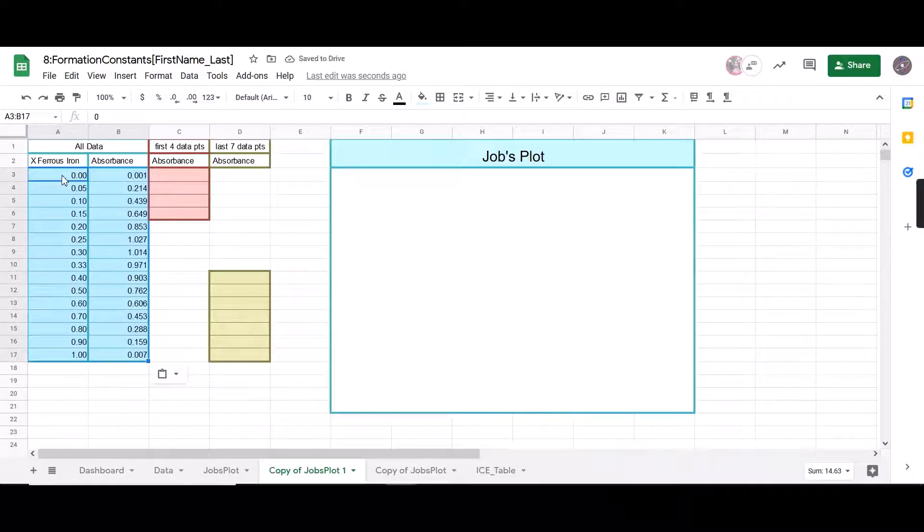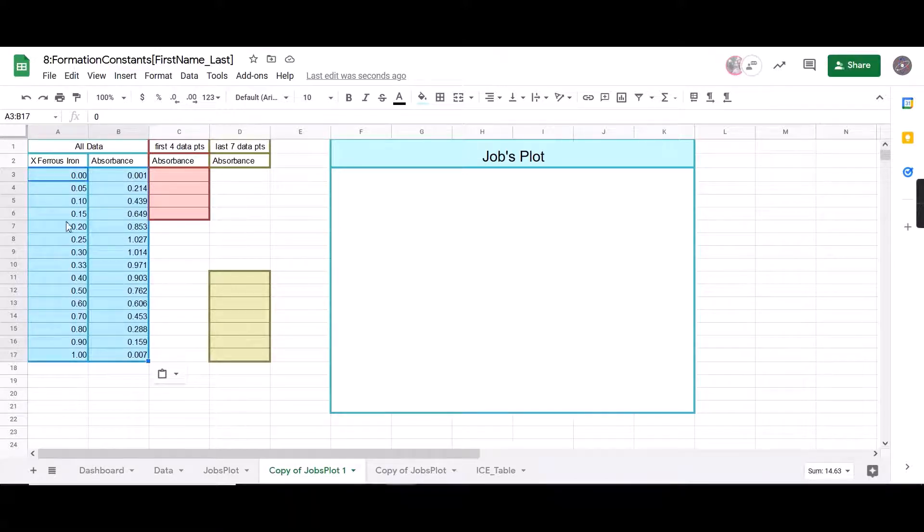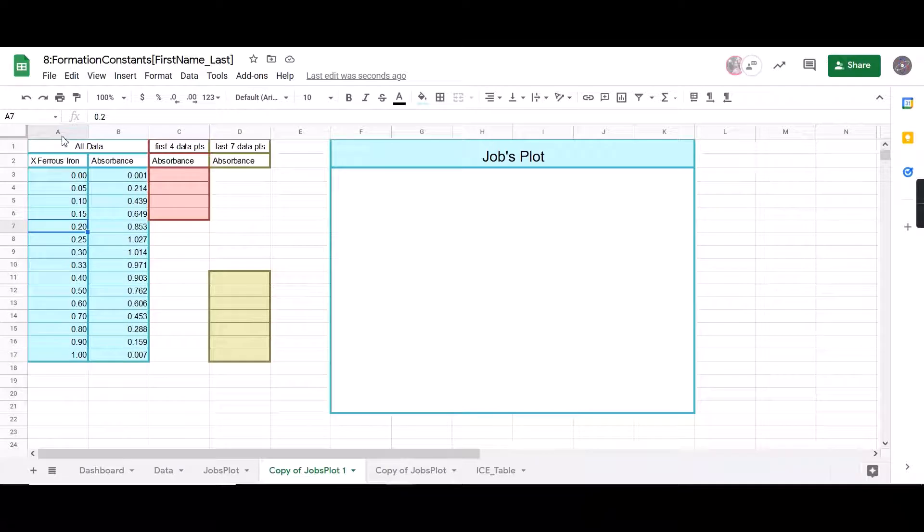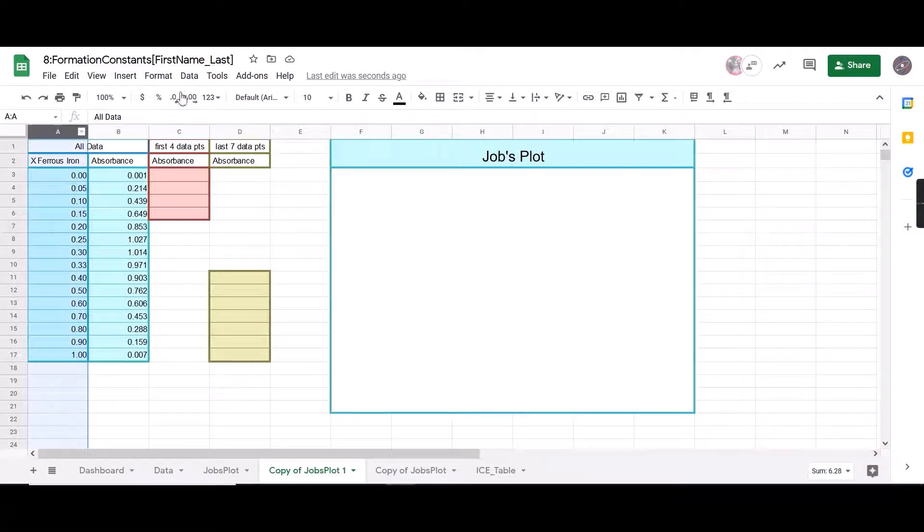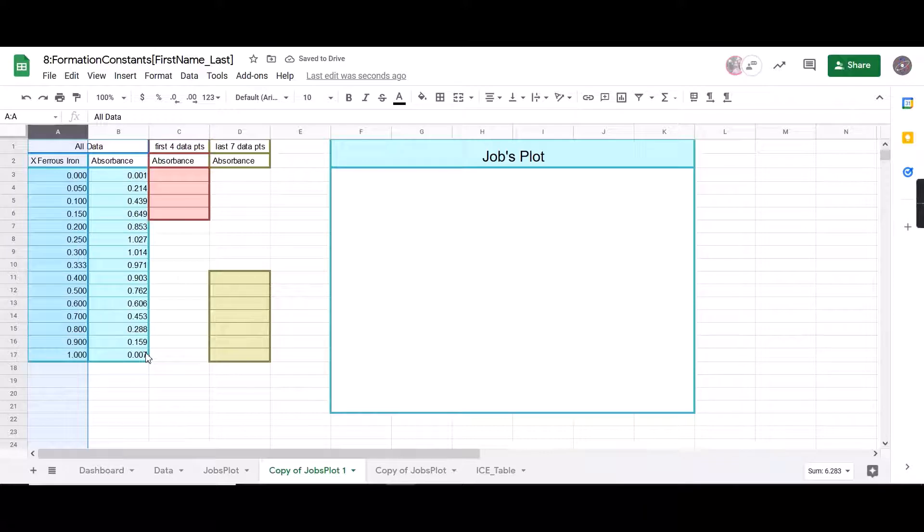I used Control+Shift+V to paste this. This way it'll paste without formatting and it'll paste my numbers only. I'm also going to double check that all of my sig figs are correct. You'll have to double check your sig figs for your data.